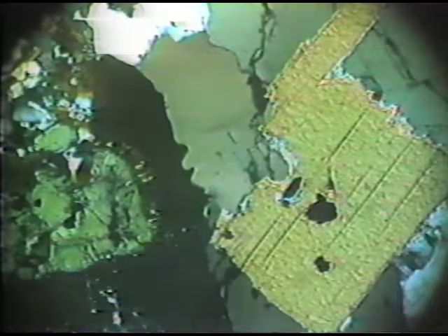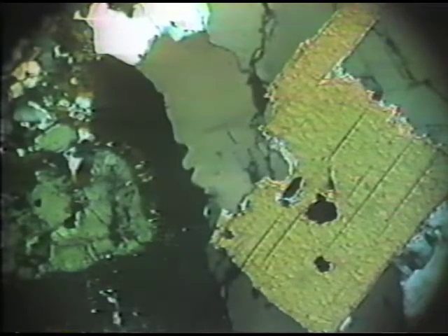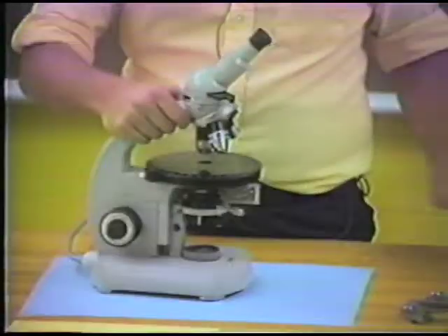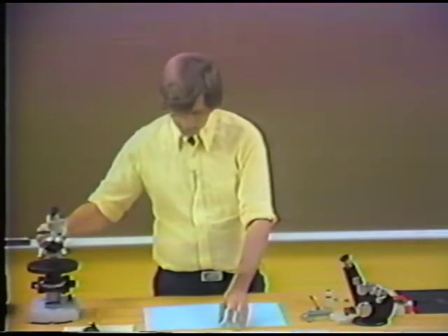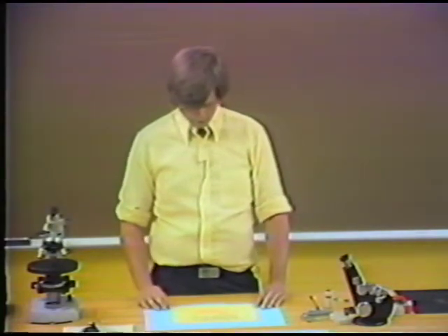So again, orthoscopic view in plane polarized and crossed polarized light. Just a demonstration of a common way of viewing materials. Now the other way we look at specimens is called conoscopic. And conoscopic is different very fundamentally from orthoscopic.